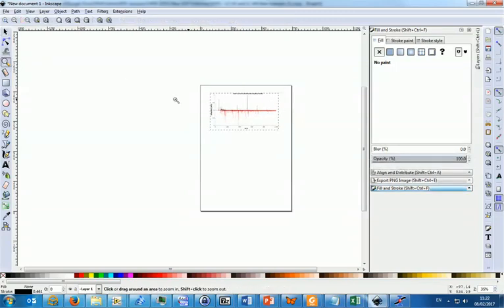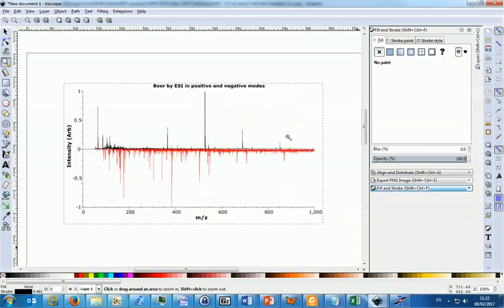Let's zoom in so we can see the graph in more detail. So you can see the spectrum looks exactly the same as before, only we've shrunk it down to the size we wanted.